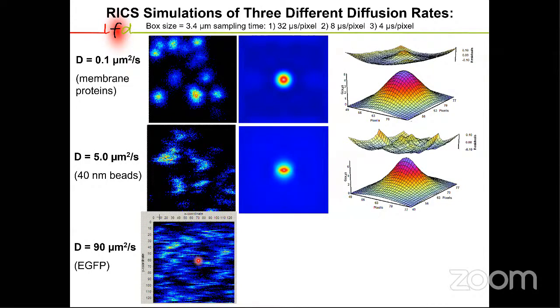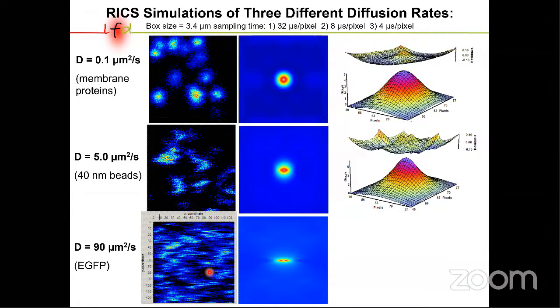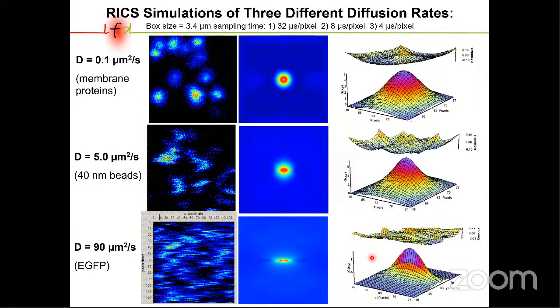And if you look closely, you can see that often you only have a streak in one line and then not again in the next line, because by the time you go to the next line, the molecule has moved away completely. So in the spatial correlation, we get this extreme compression now. So we have very elongated correlation from one pixel to the next in the same line, but then not much at all between lines, because most of the time the molecule has moved away by the time we get to the next line.